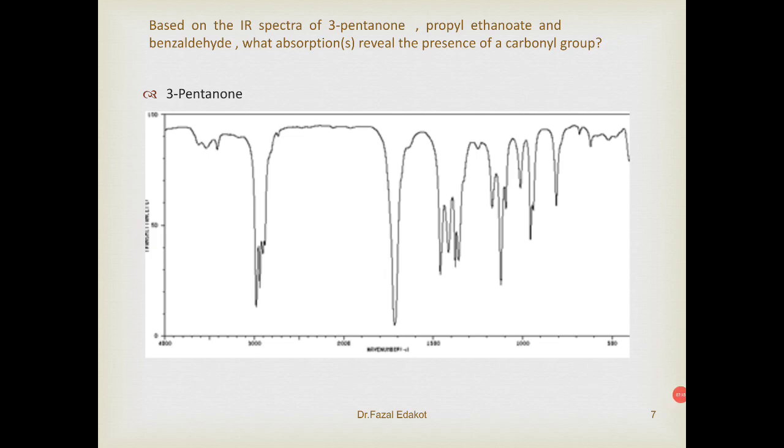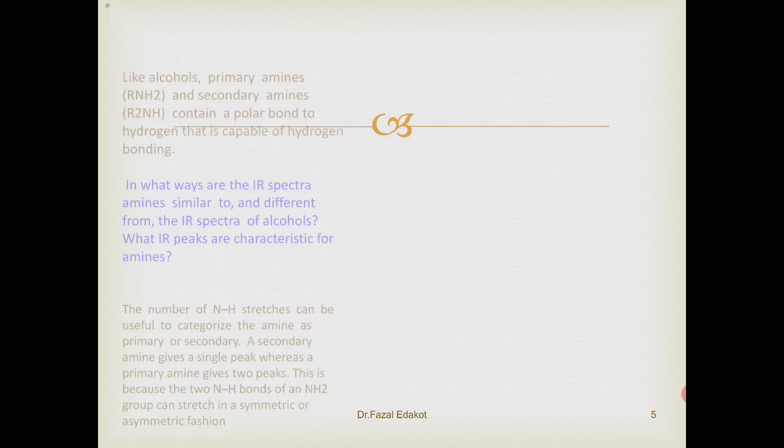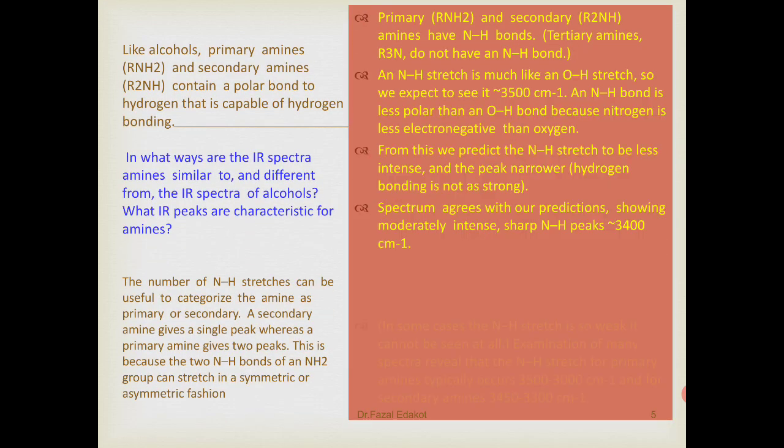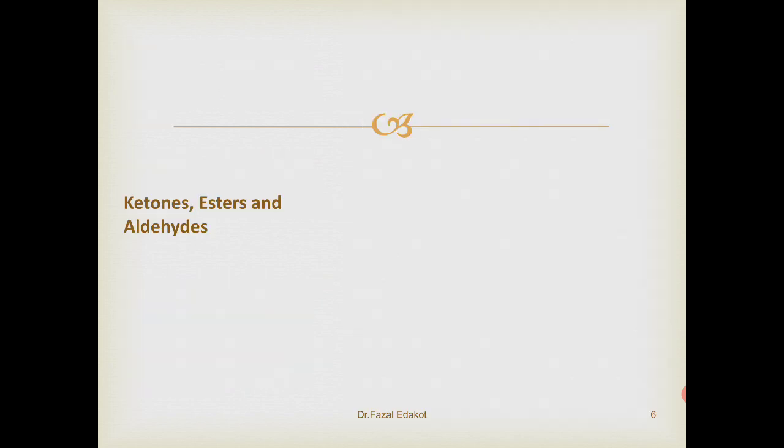Next, the prestigious group of functional groups, that is the carbonyl functional group, based on the IR spectra of 3-pentanone, propyl ethanoate and benzaldehyde. What absorption reveals the presence of a carbonyl group? So let's recall these points, that is ketones, esters and aldehydes if you take.